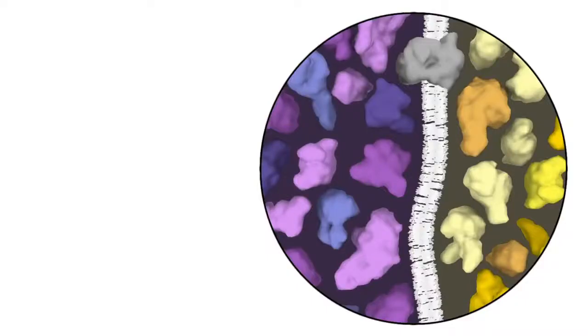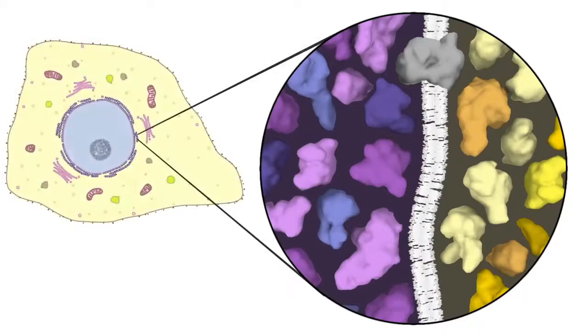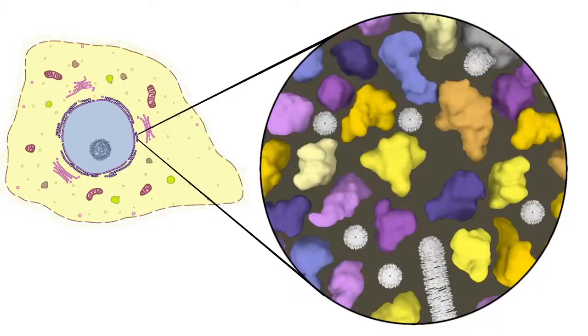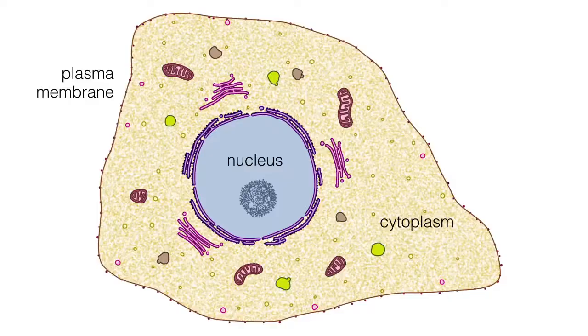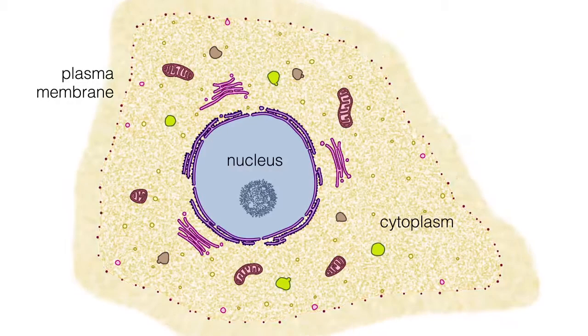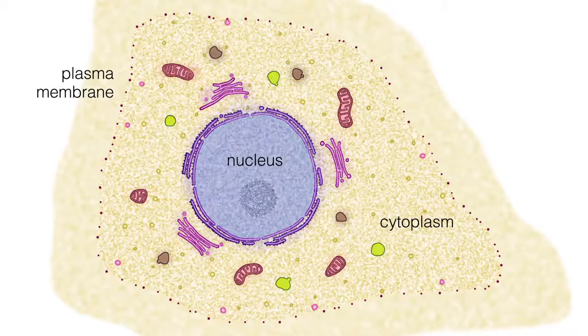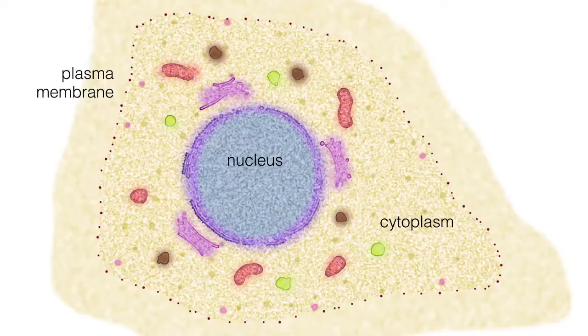In the Western blotting procedure, proteins are first isolated from the rest of the cell's components. To extract proteins from cells, researchers use chemical-based and/or physical-based methods to disrupt the cell's plasma membrane and release the proteins inside it. Chemical-based lysis uses various types of detergents to make proteins accessible. For example, weak detergents are used to extract water-soluble proteins inside the cell without disrupting intracellular membrane compartments. Strong detergents are able to solubilize or make available the proteins found within all membranes.